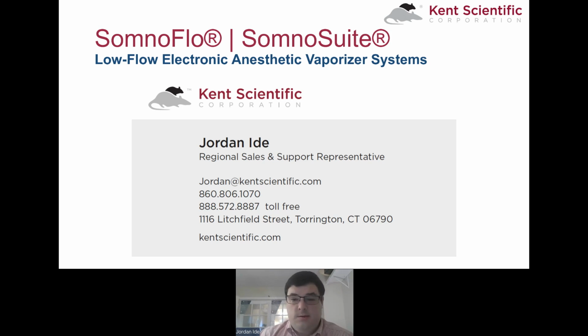Thank you. Is electrical power needed for anesthesia delivery? And what would somebody do if power were to get interrupted? Sure. So the system does require power. It uses a standard 12-volt power supply. If you were to experience power interruption, the system would automatically power back on, and then you can start your anesthetic delivery right away again.